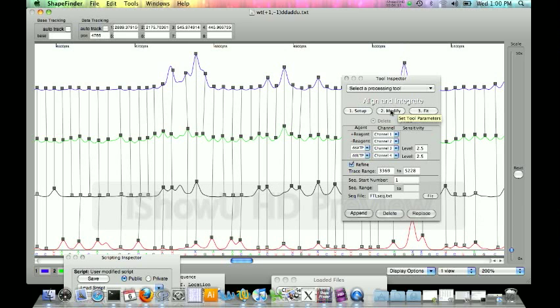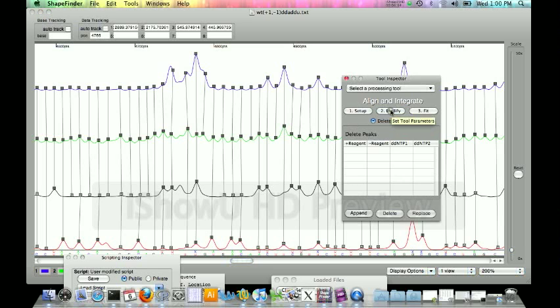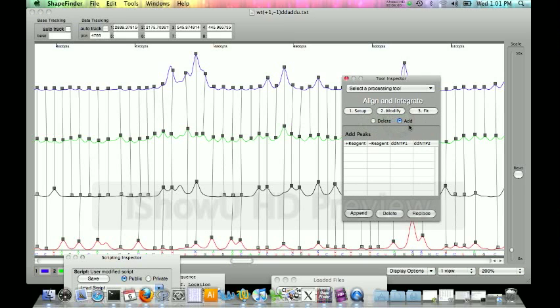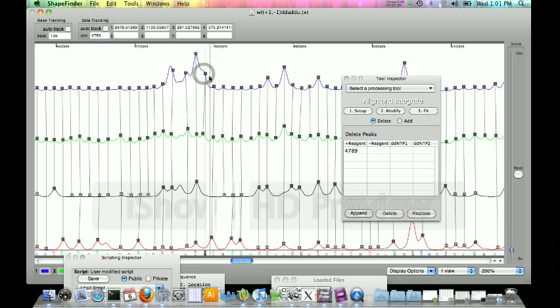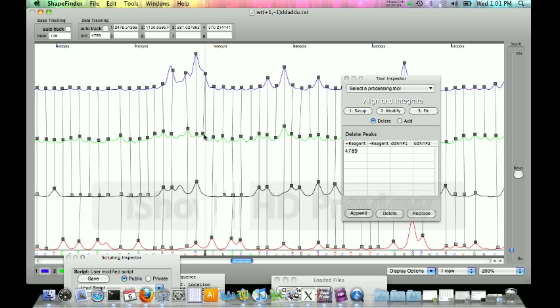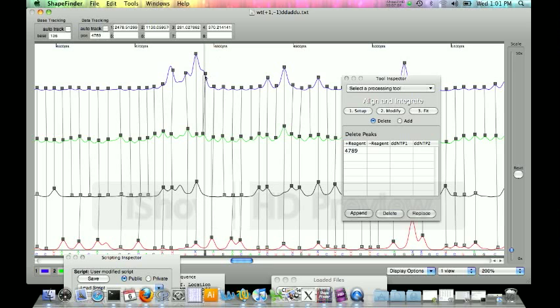What you have to do now is click on the modify button to modify the computer assigned peaks. We have two functions here: delete and add. Add is the manual insertion of the peaks essentially and delete is the deletion of the peaks. But the tricky thing is you cannot delete a manually assigned peak with a delete function. You can only delete computer assigned peaks with this delete function. You have to come in here and you can click on the peak in the first filter.